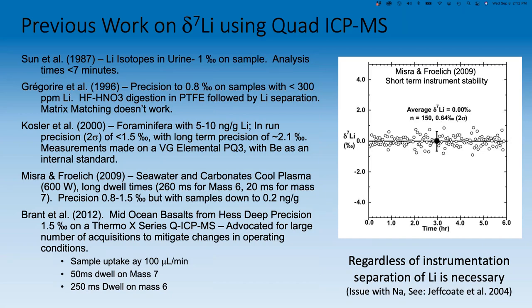Really enjoyed the presentation. Have you tried shorter dwell times? I was using 2 millisecond and 1 millisecond for copper and lead ratios. Have you tried self aspiration rather than peristaltic pump to improve precision? So there's two questions really there.